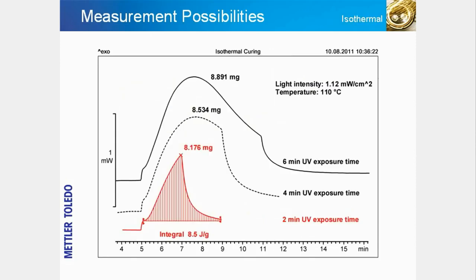In an isothermal experiment, changes in the sample are measured over a certain period of time, during which the temperature is kept constant. This measurement mode is used to obtain information about the time that elapses before an effect occurs, or about the duration of an effect. For example, in the determination of the oxidation induction time, the parameter of interest is the time that elapses before the sample starts to oxidize at a particular temperature.